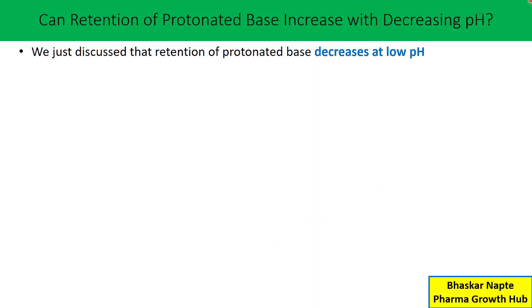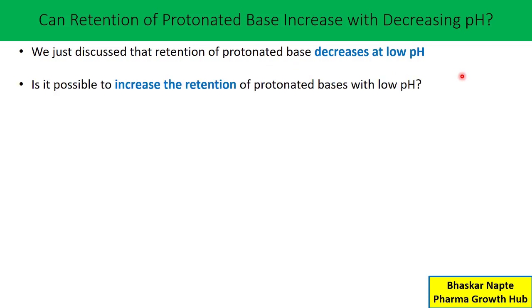So, we just discussed that retention of protonated base decreases at low pH. But the point is, is it possible to have an increase in the retention time of a protonated base at low pH? And that is the point of discussion for today. Now, there are a few references which say the above statement is true.